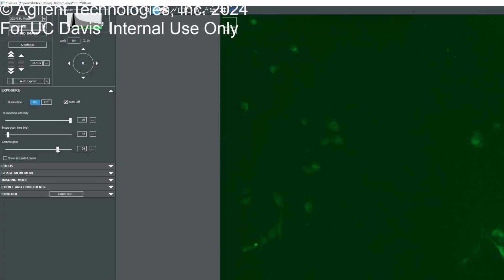But I guess also bump up, like I'm thinking in a plate-based assay, if you want to auto expose every single well, but then can you increase the exposure just a little bit from that? I see what you mean. Exposure level? Yeah, I see what you mean.